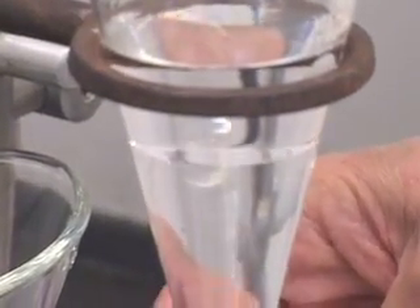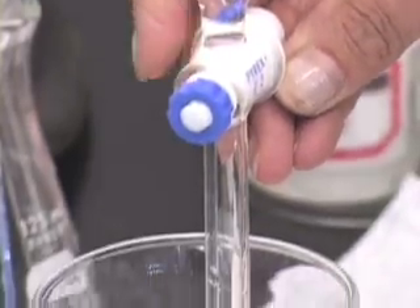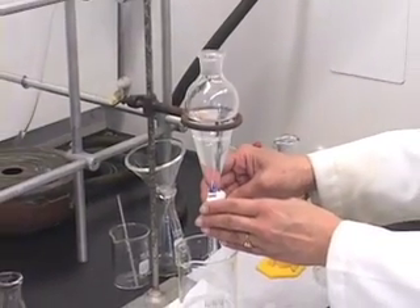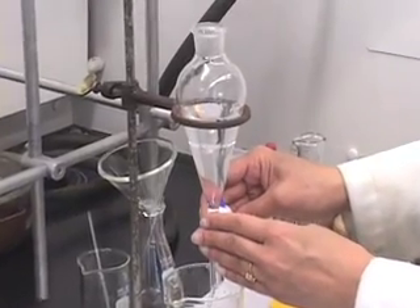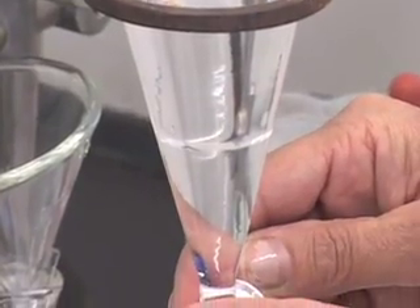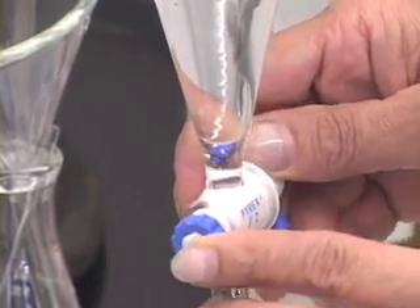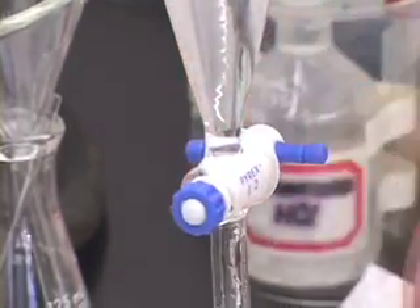So you want to drain the bottom aqueous layer out. Give it a couple of minutes and then drain the aqueous layer — we do not want to collect the aqueous layer, so it can go in the waste container. Go slower as the layer demarcation approaches the Teflon stopcock. Stop it.